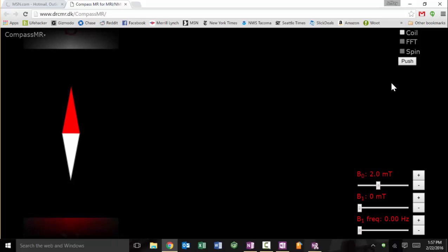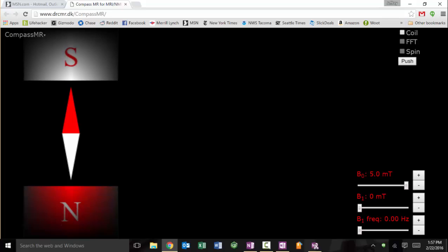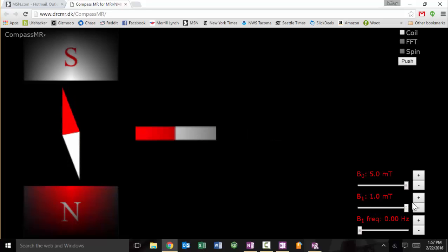All right, so if you look at this, a nucleus is pretty similar to a compass where you've got this little magnetic field. And what we do in an NMR is we actually take a really strong magnetic field which will cause it to align, right? So the north pole of your spinning nuclei will be aligned with the south pole of the bigger magnet and vice versa. And then the question is, well, why is this useful? And there's a phenomenon called resonant frequency, right? So let's say I've got another magnetic field and I bring it in from the side, right? I can knock it off axis a little.